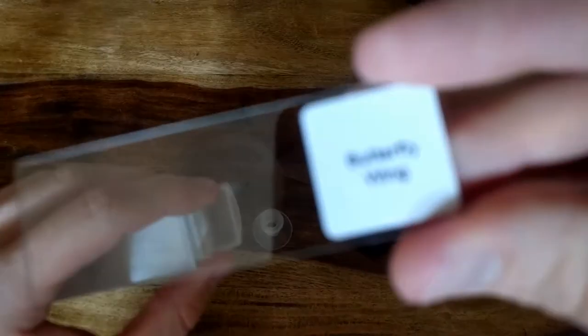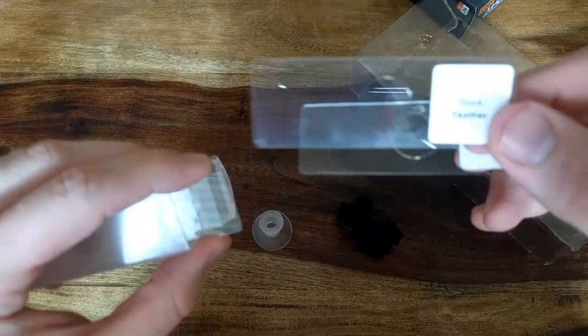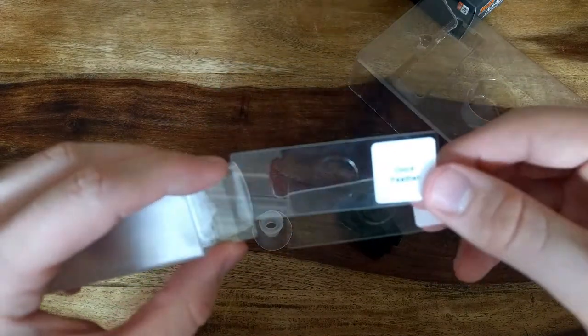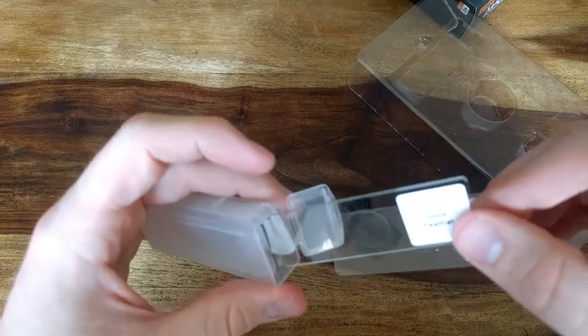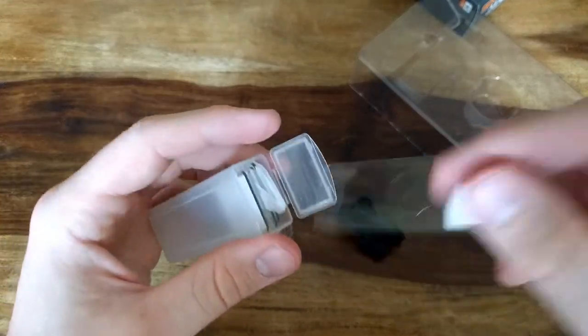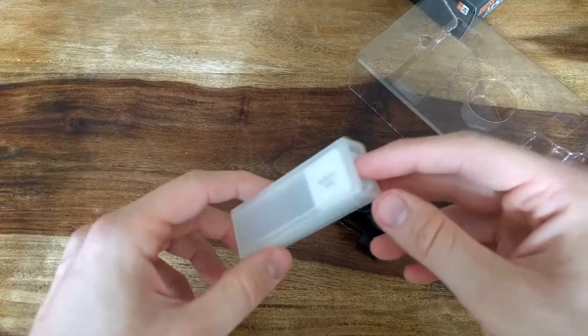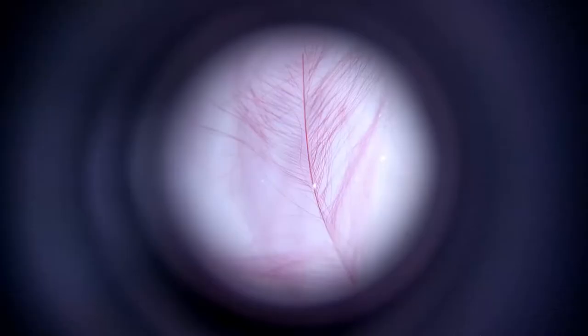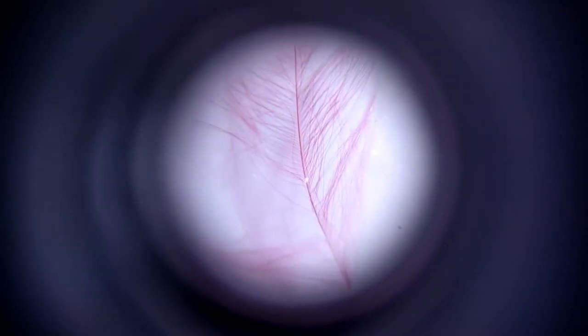This is a butterfly wing, but it won't focus on it. There is a duck feather inside, and there are three other samples that are empty that you can look at. Let me just put the microscope on the phone and let's see what we get.